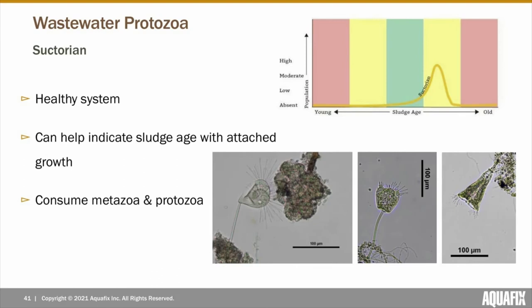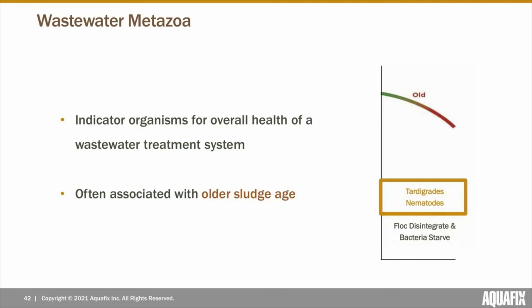Some stalk ciliates also have the ability to separate from their stalk and swim freely to avoid unfavorable conditions. If suctorins are observed in your wastewater plant, they're an indication of a healthy activated sludge system. If attached growths are developing on the stalk of a suctorin, it can act as a gauge for the sludge age — similar to stalk ciliate colonies, the more attached growths, the older the sludge age. Suctorins come in many shapes and sizes but all have tentacles used to capture and consume metazoa or protozoa. However, if their tentacles are observed scrunched up, it's an indication of high levels of ammonia.